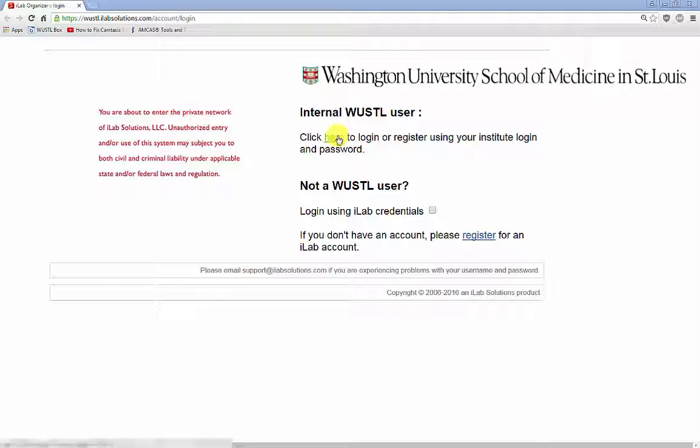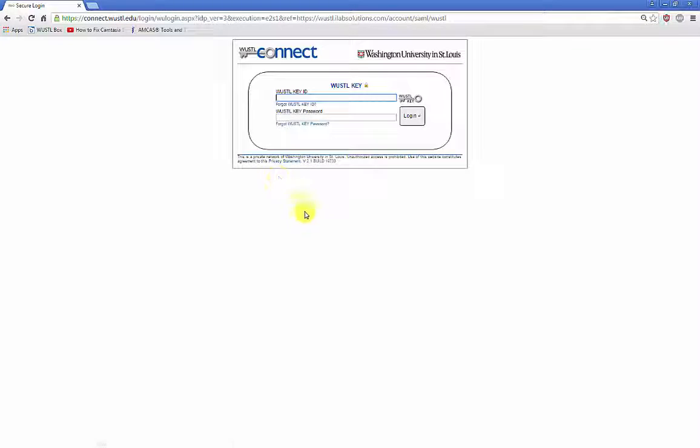So I'm going to click here and I'm going to enter my Wustl information. And I'm going to do login.